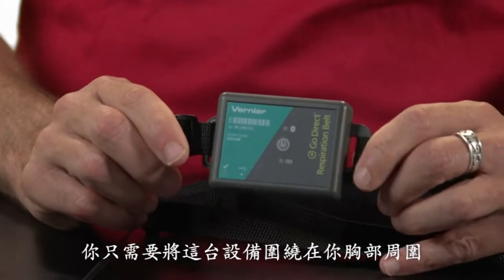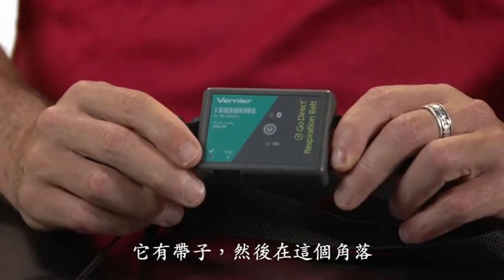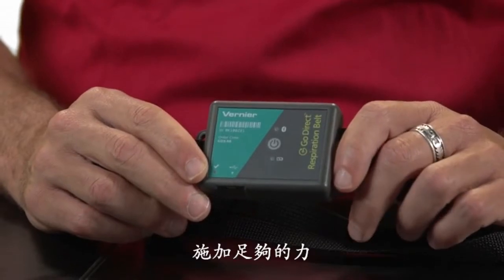Now it's really simple to use. All that you have to do is put this little device around your chest. It has a strap, and in the bottom corner there's a little LED by this check mark that tells you when there's enough force being applied to the strap.